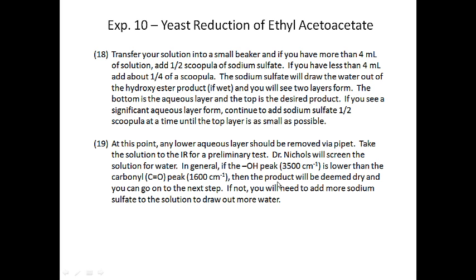Those 2 layers: the top layer is your hydroxy ester product, and the bottom layer is the water that the sodium sulfate is now drawing out of the product. So if you see those 2 layers start to form, then you can add another, let's say, quarter of a scoopula, and if you see even more of the bottom layer form, then you're going to add probably a third quarter of a scoopula.